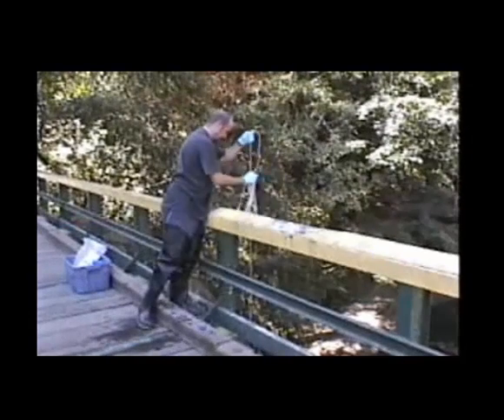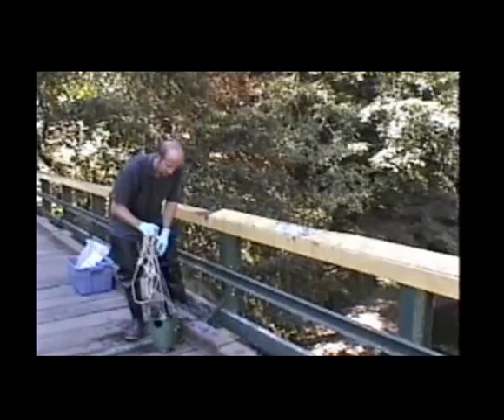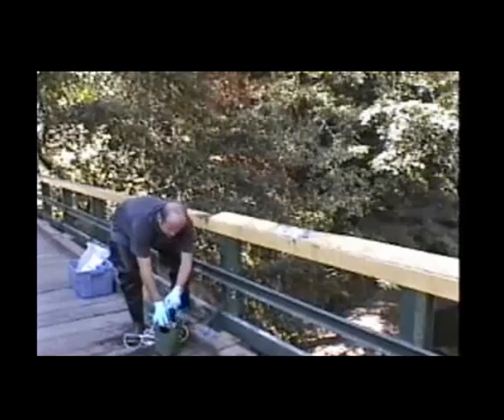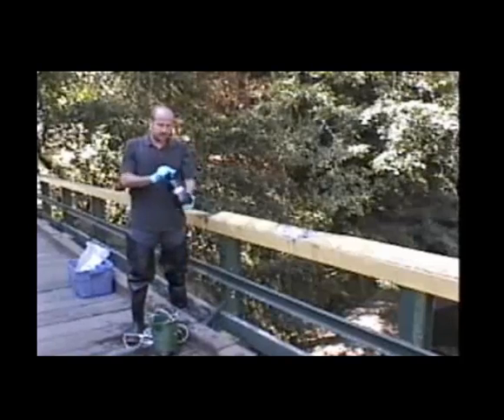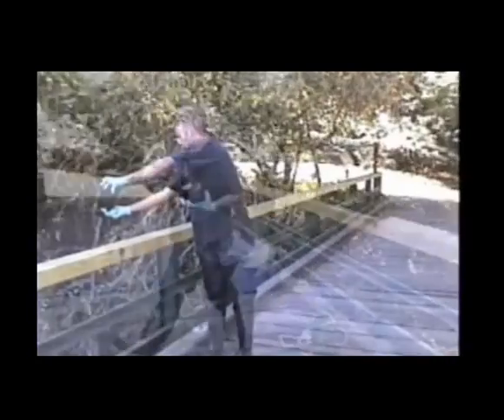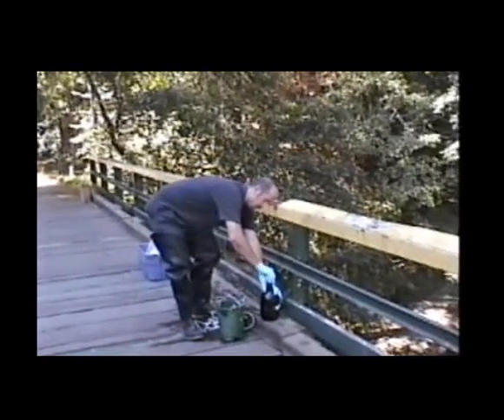We'll have to rinse the bottle 3 times. Cap the bottle. Flush some of the ambient water around in the bottle, then dump the water downstream. We'll repeat this process 3 times so we can flush the bottle with ambient water.